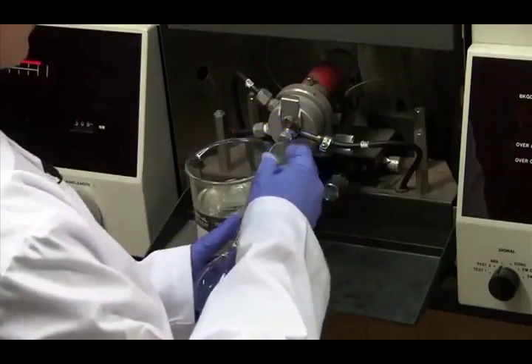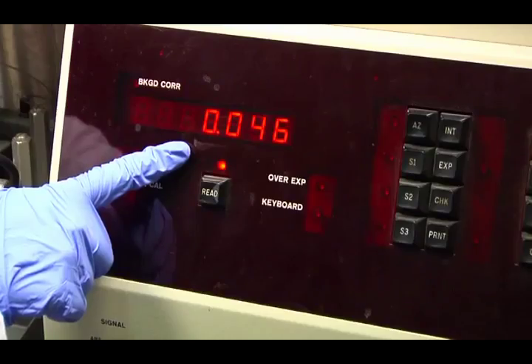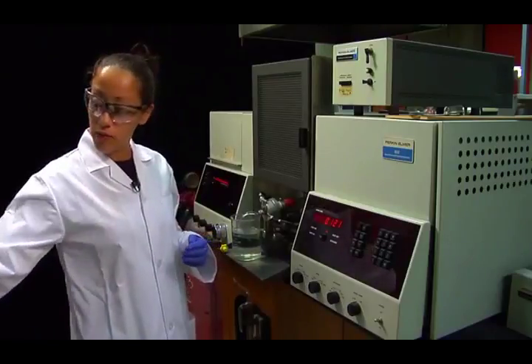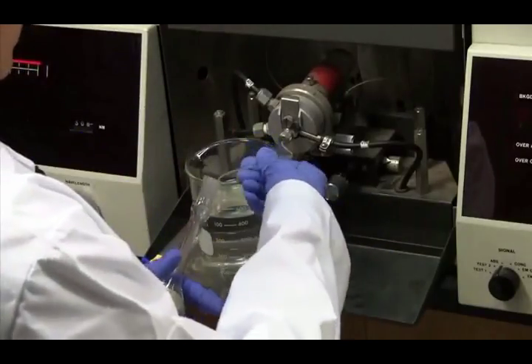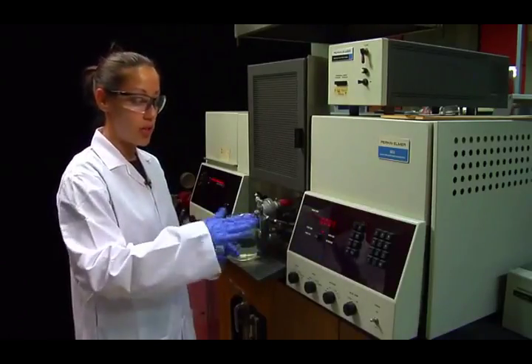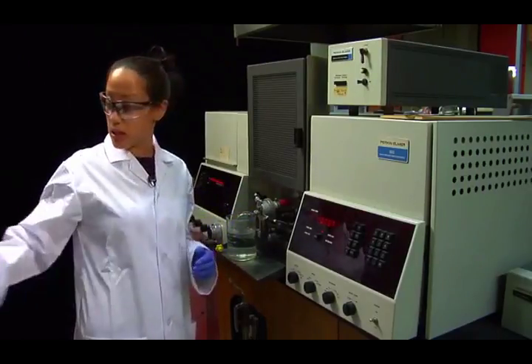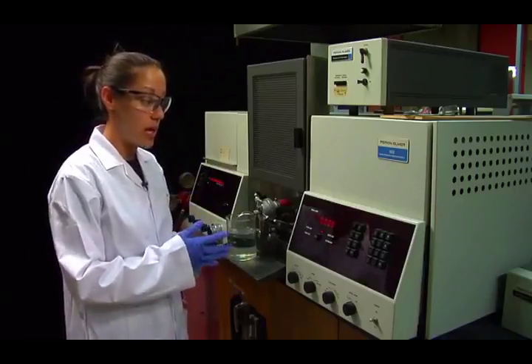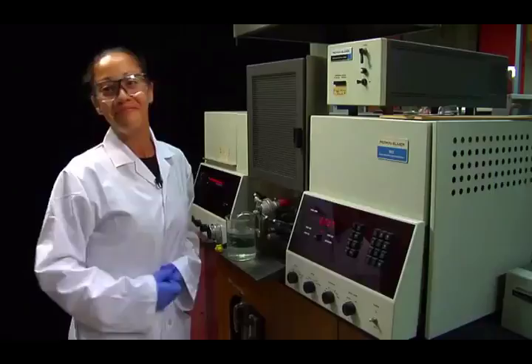So just sticking that in there, and then you'll see an increase in your absorbance. And it's that quick. If you find your numbers fluctuating a lot, feel free to, at any time, take your zero, and you can zero the machine at any time, just to make sure your background is relatively the same for all your standard readings. And then you would continue with the rest of your standards, and now you have enough data to build a calibration curve and measure your unknown.